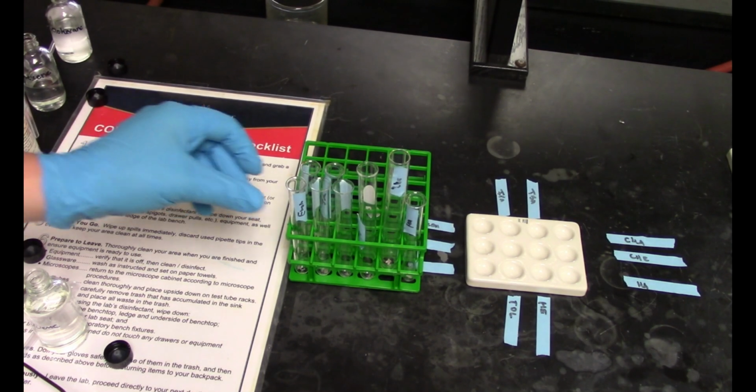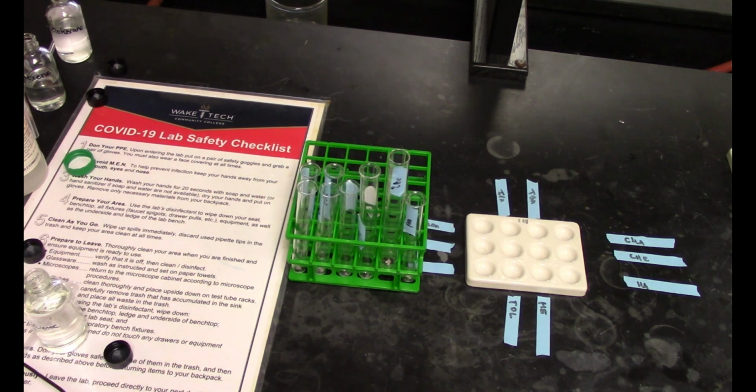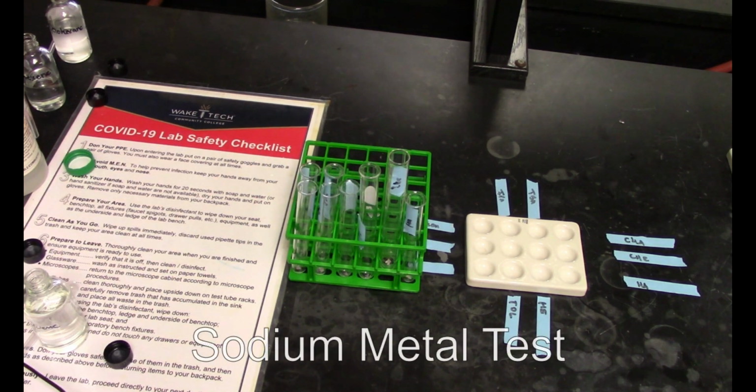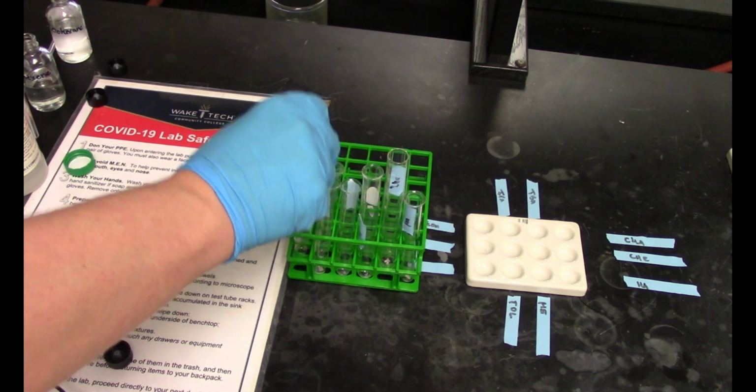Alright, so for the first part of this, we've added sodium to all these little test tubes, and what we're going to do is look at the effect of, see if there is a reaction between the individual organic compounds and the sodium metal. So the first one we're going to start with here is ethanol.